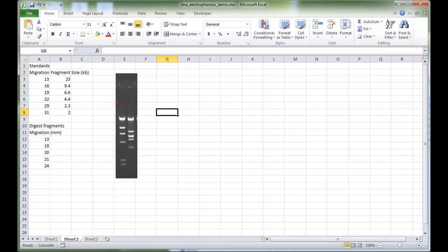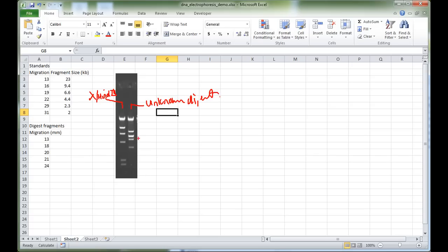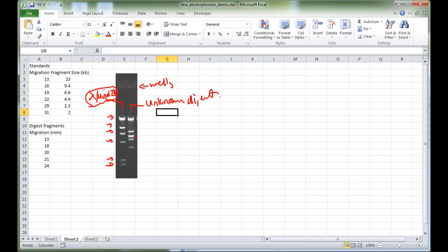In our gel, this particular lane here contains the lambda HindIII standards, and this particular lane here is our unknown digest. We can measure the distance between the wells and each of the bands, and plot them against the known fragment size — because this standard is purchased from a manufacturer who tells us exactly what kilobase size each band is.